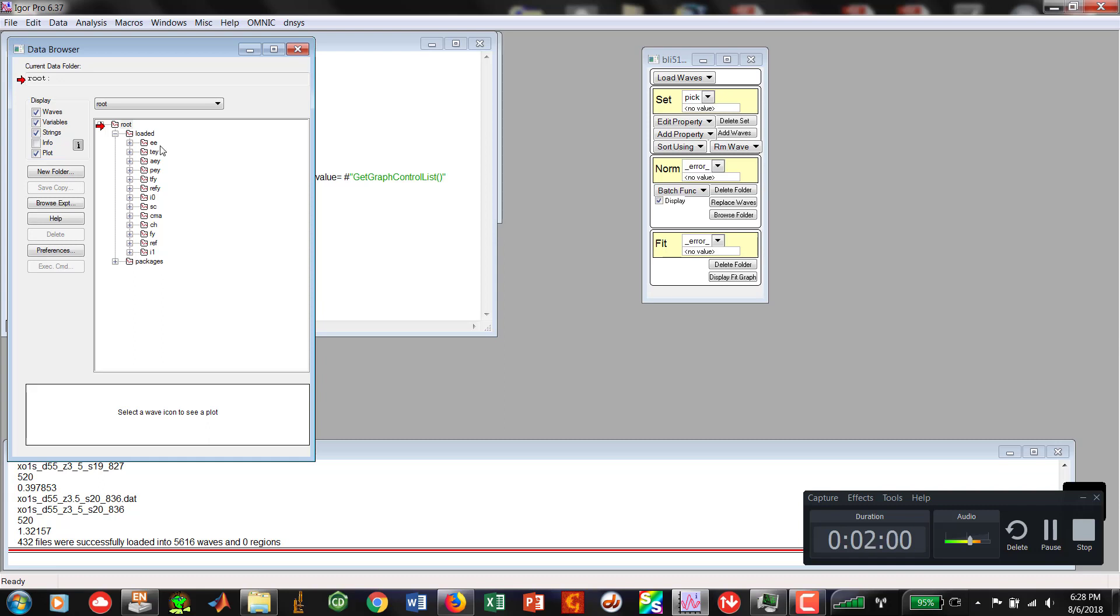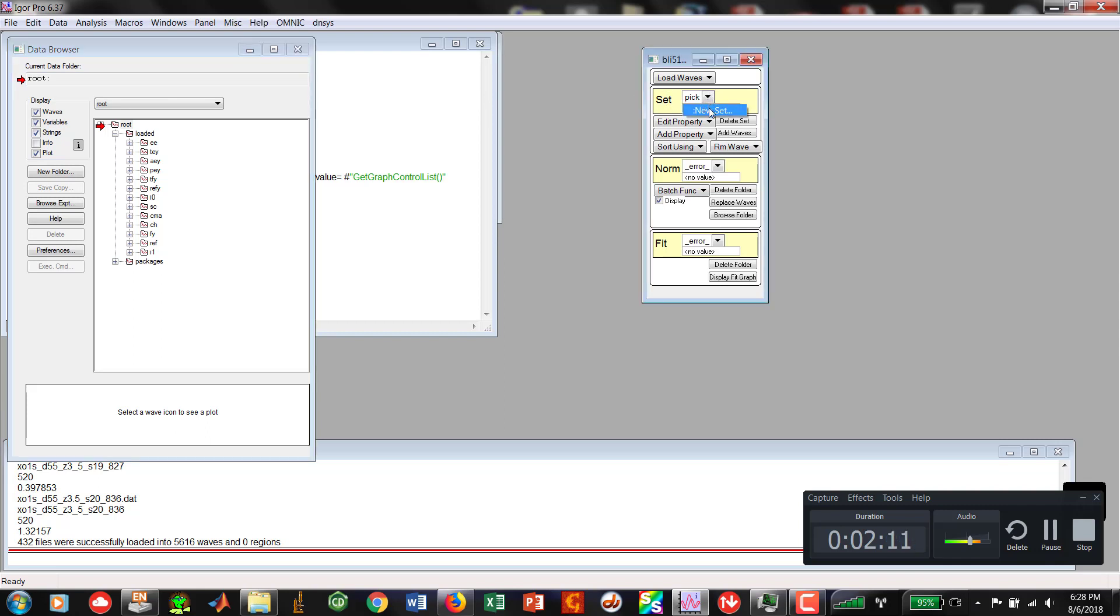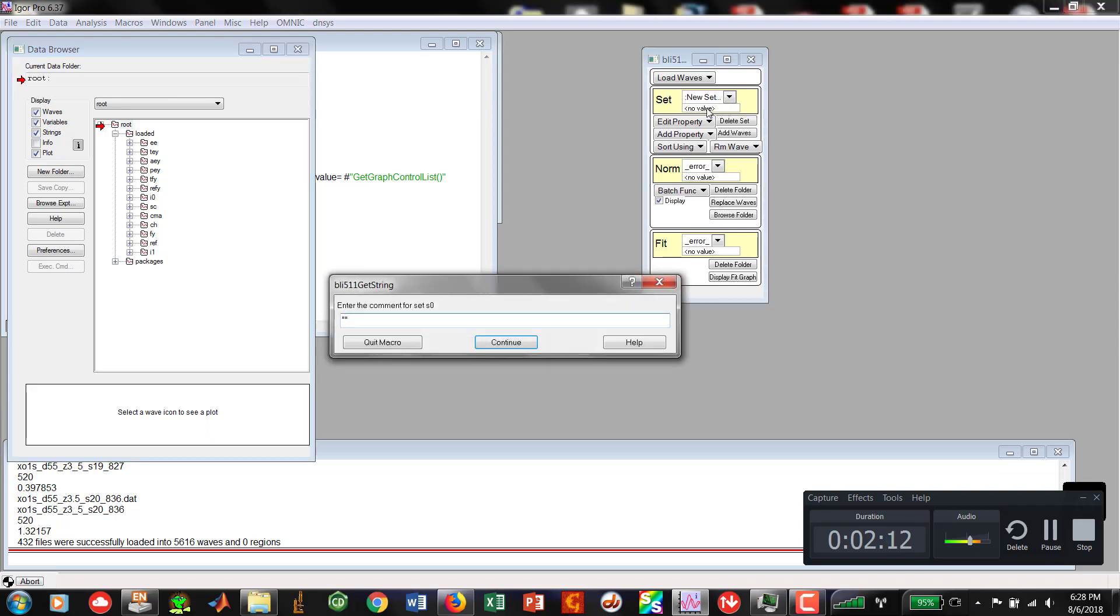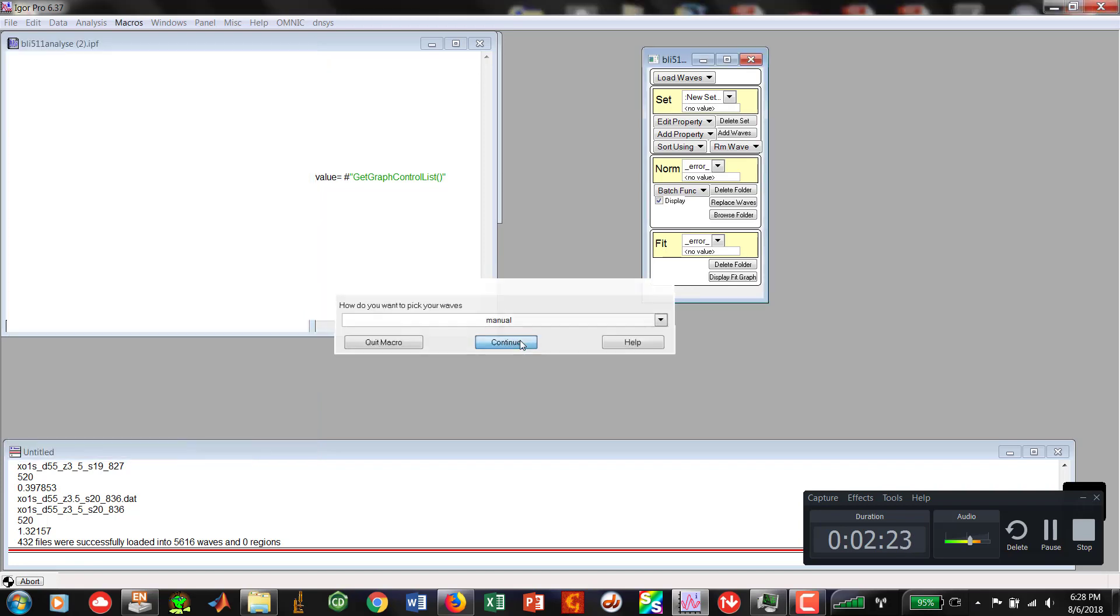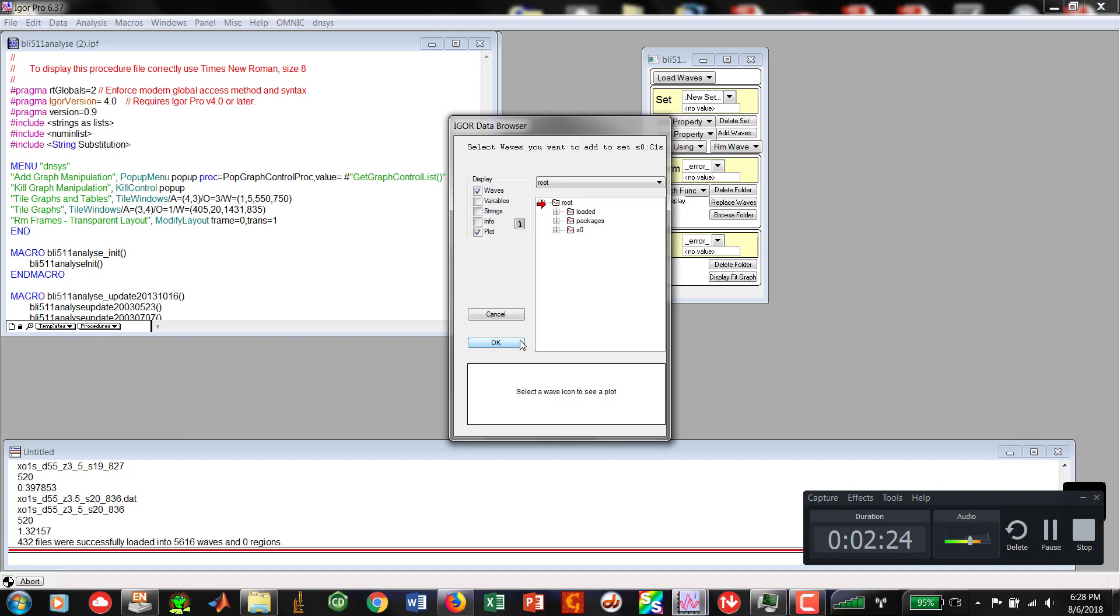What we're going to start off with is EE. Remember, EE is our mono. TEY is the amount of electron counts coming into the detector. So now let's go over to set. We're going to get a new set. Now, the first one that we're going to do is going to be carbon 1S. And when we do this, we're actually going to pick all of the EE's manually in our data set for carbon. But we're going to do that in loaded.